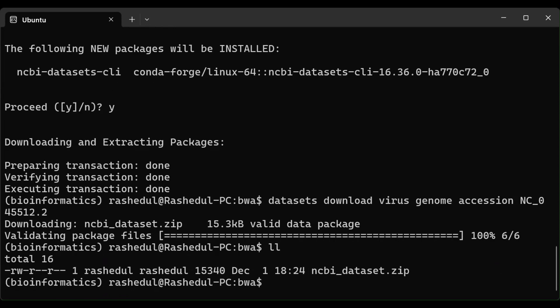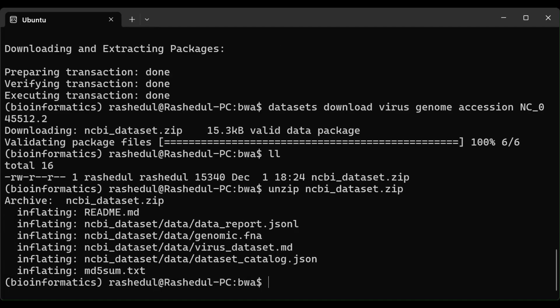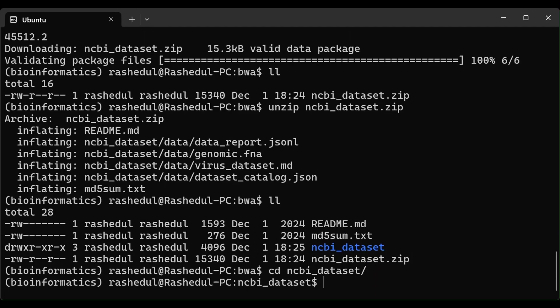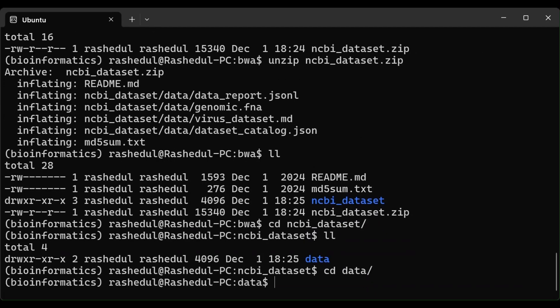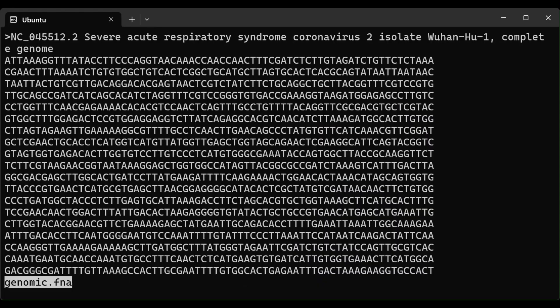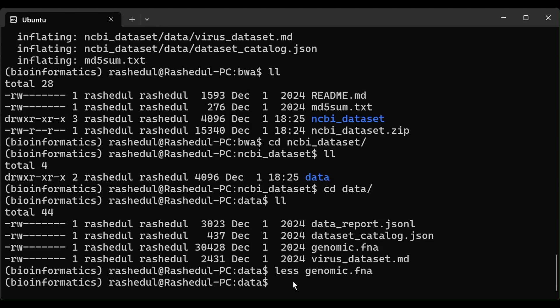There is a zip file — let's uncompress it. It has extracted all the files. There is a data directory, and the genomic.fna is the genome file. Let's take a look into this file. Yes, this is the coronavirus genome — this is the complete genome with this accession number.